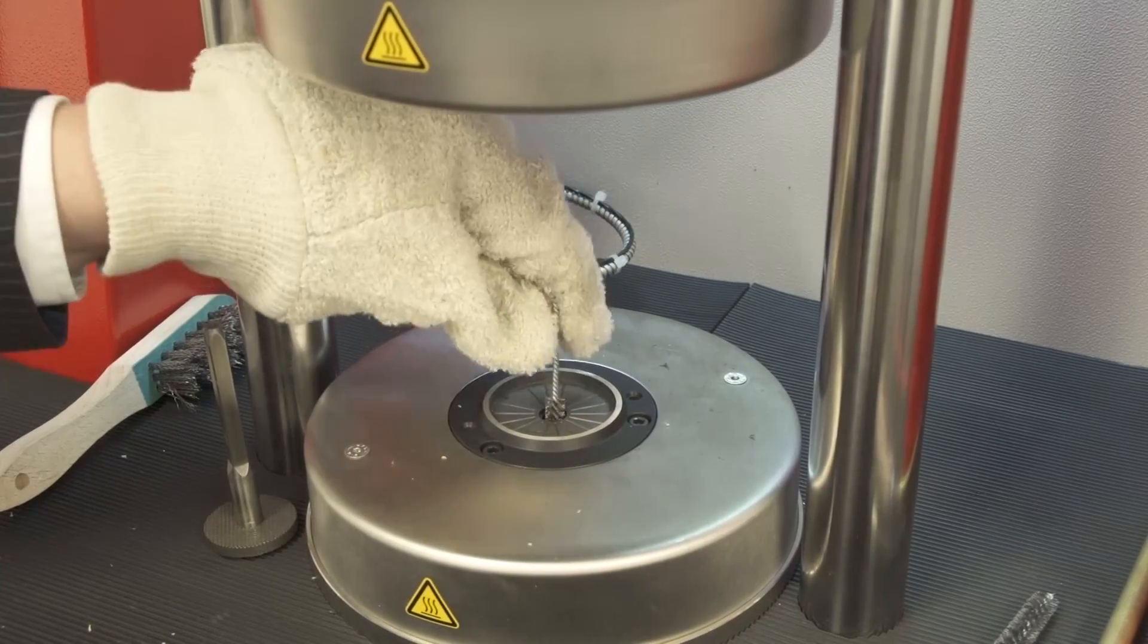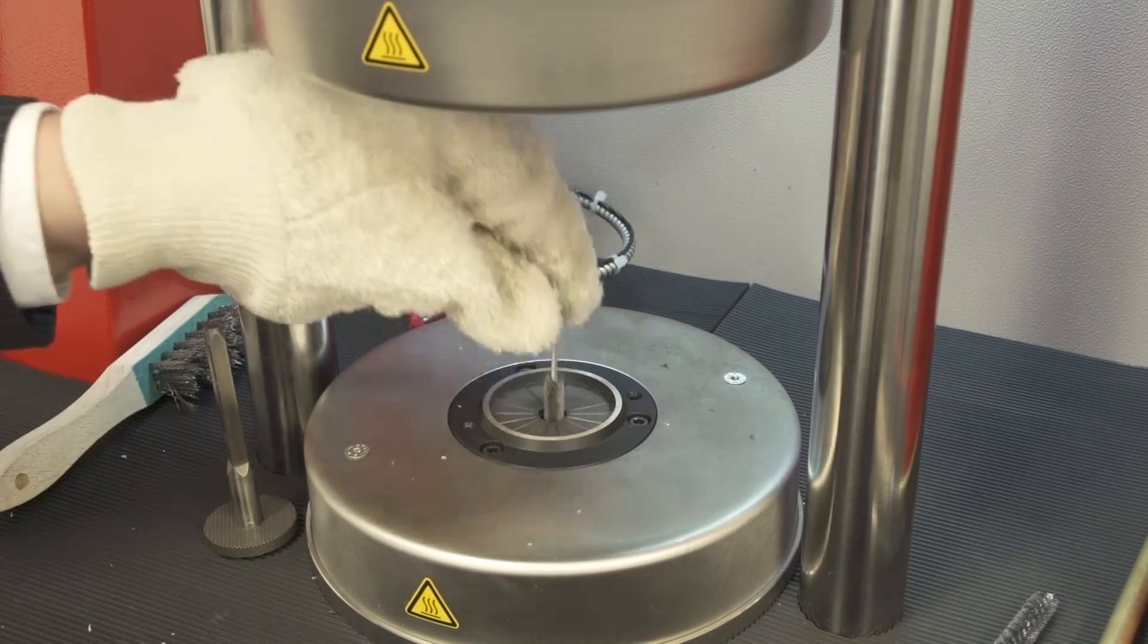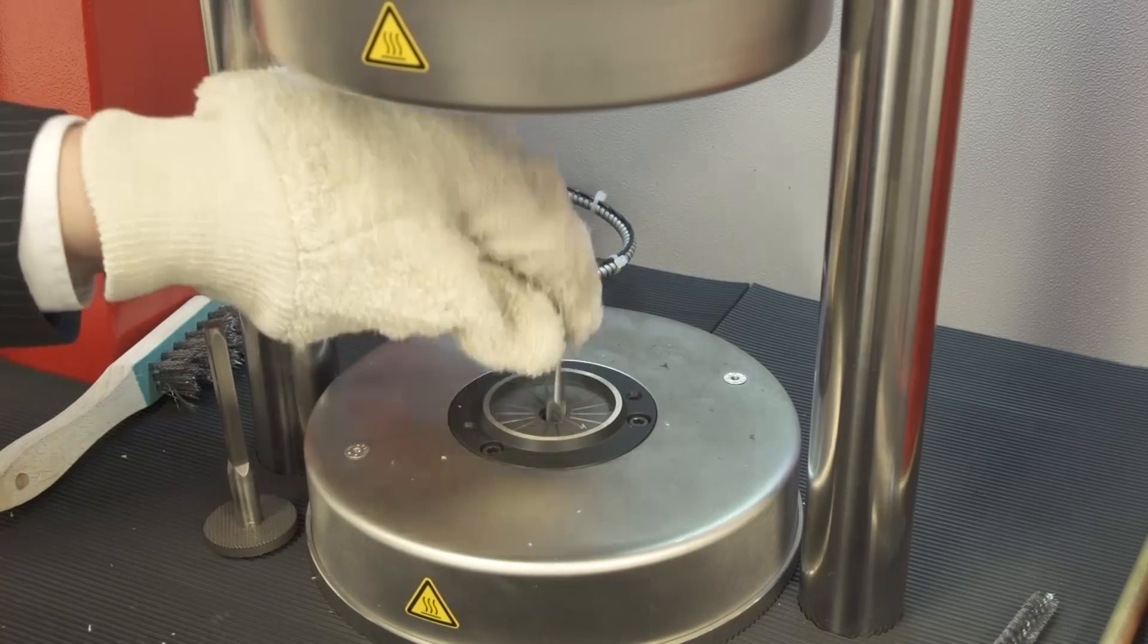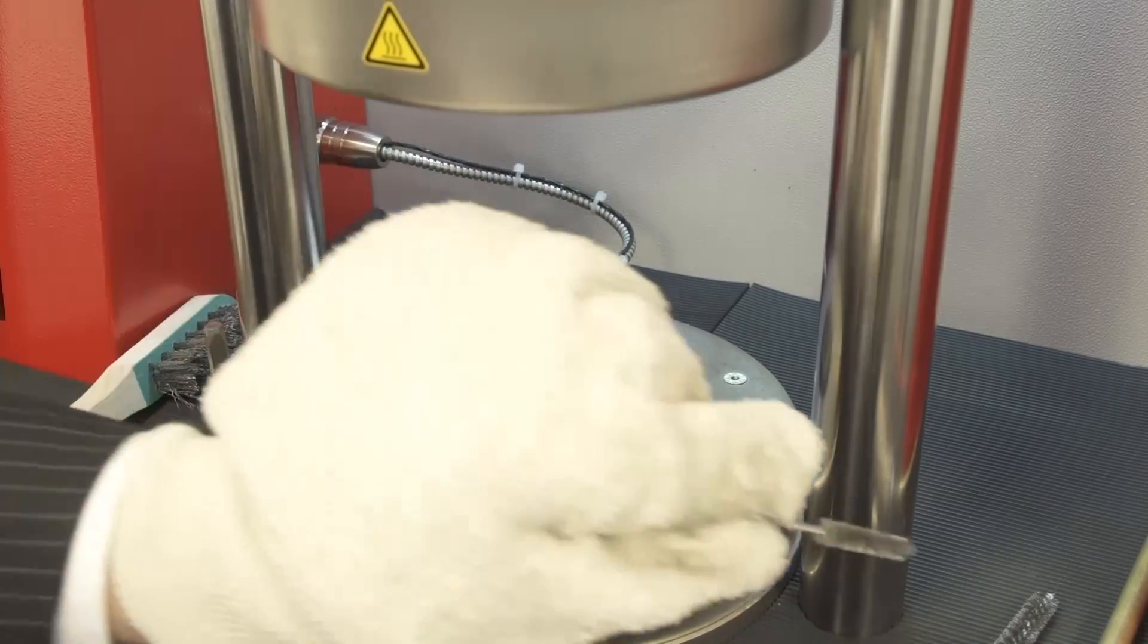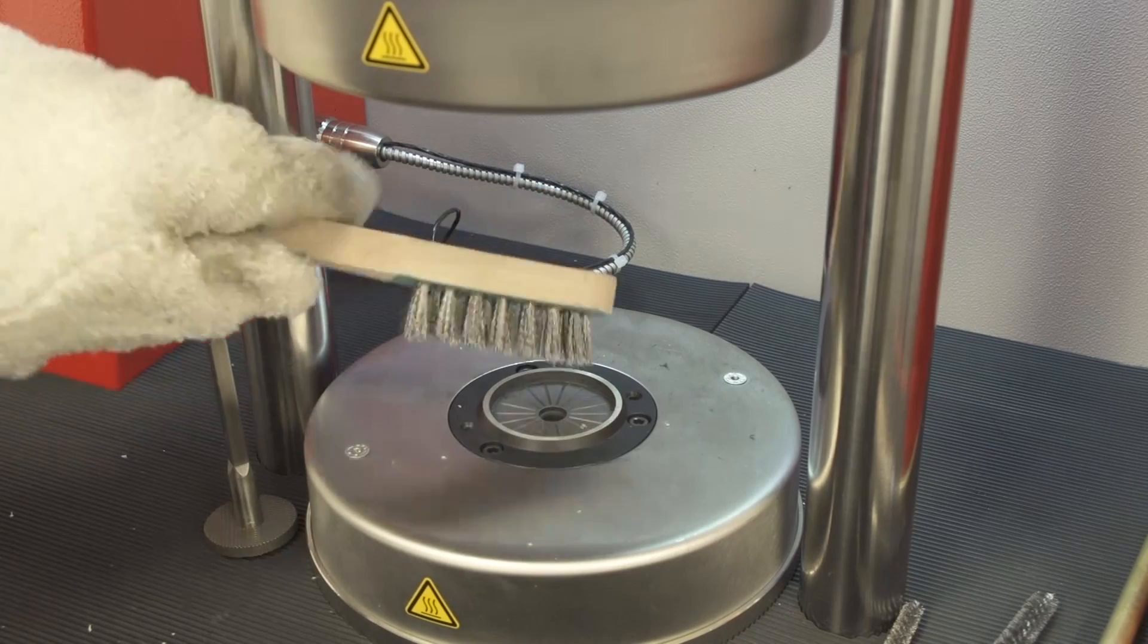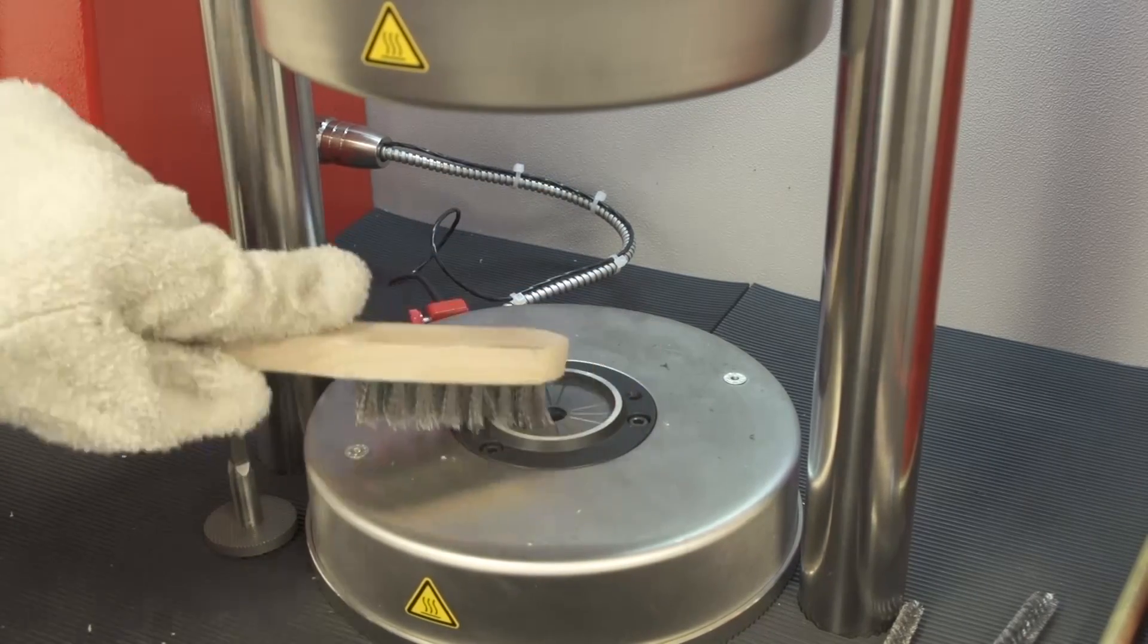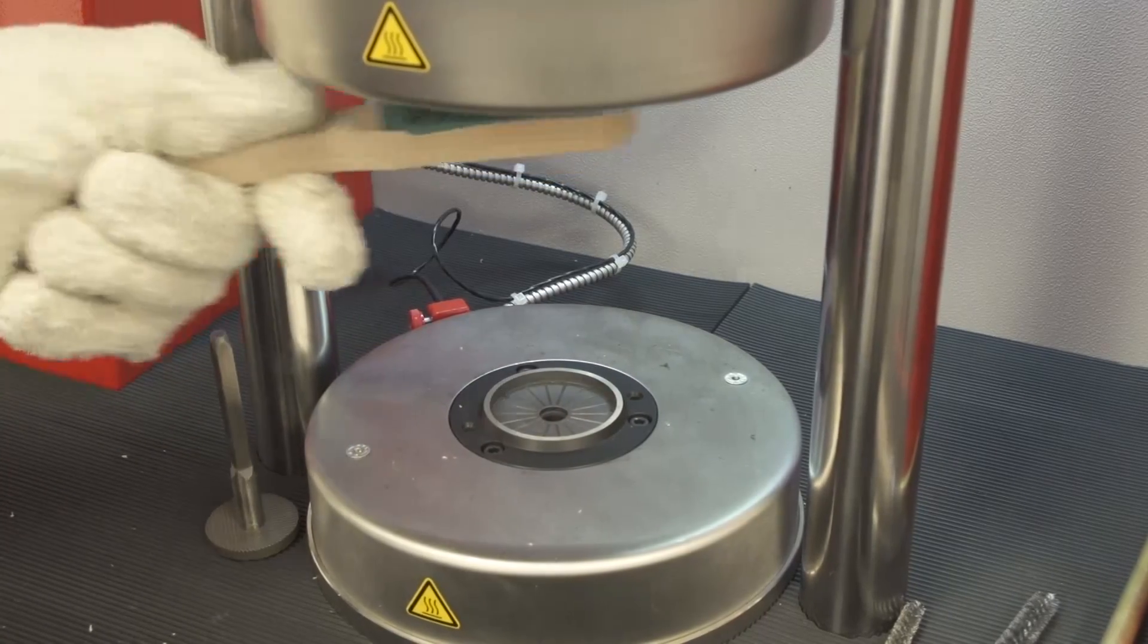Always wear heat protection gloves as the dies are heated. Also, use the provided stainless steel wire brush to remove any material residue from the lower as well as the upper die.